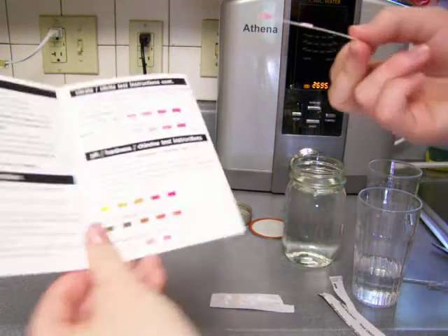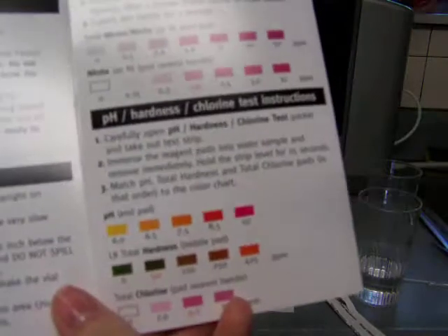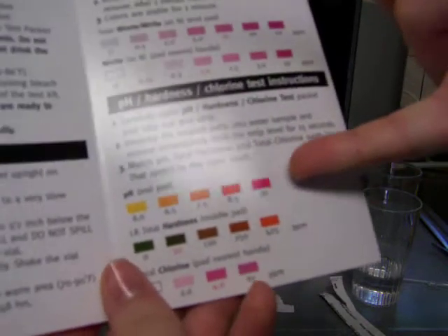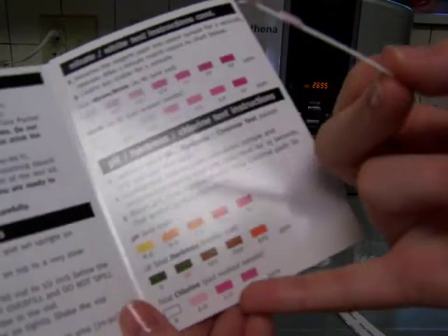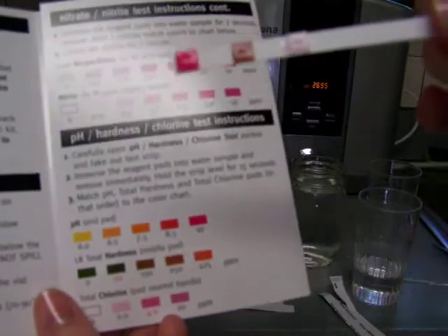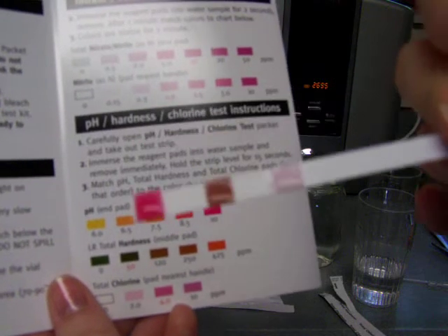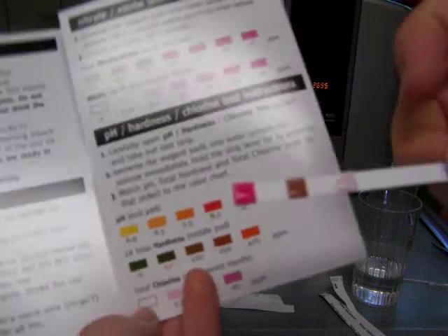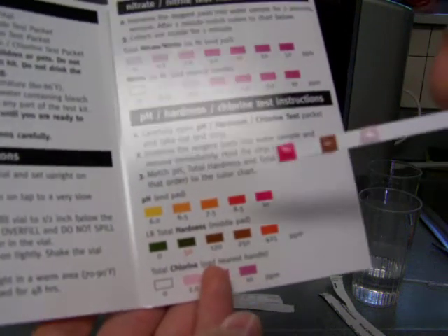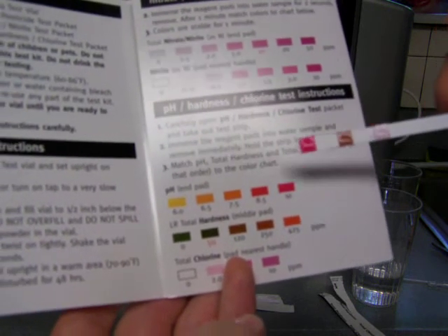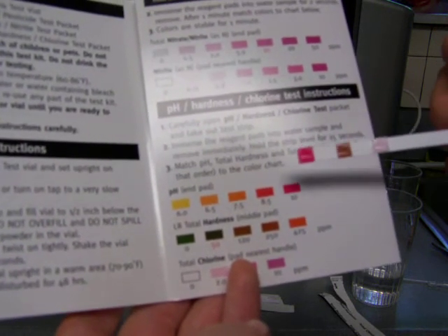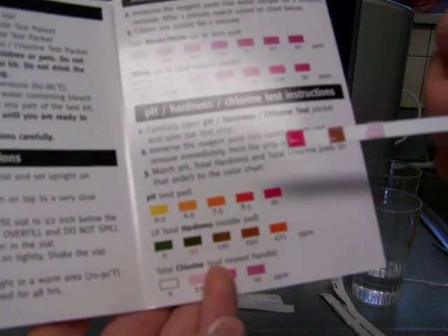Wow, this is like intense. So this is the pH hardness chlorine test instructions. Here's the pH color chart. This is the hardness color chart. And this is the chlorine color chart. Now if we look at this, this very left one is the pH. And it looks like it's a 10, or possibly between an 8.5 and a 10, which is pretty alkaline. This is like city tap water.